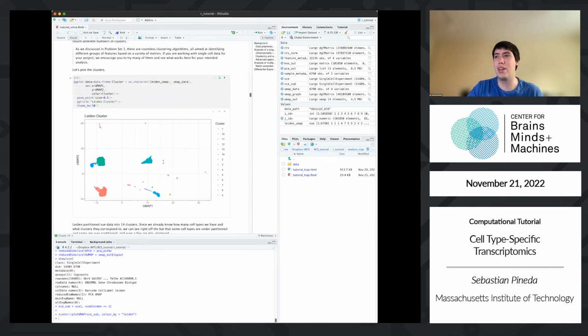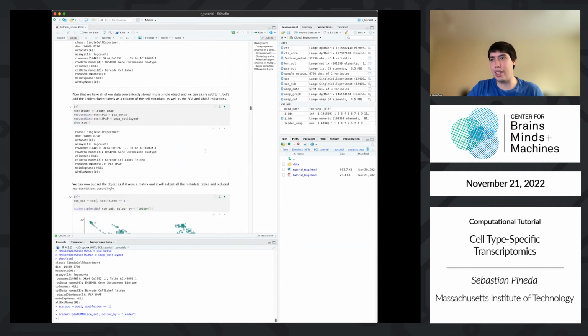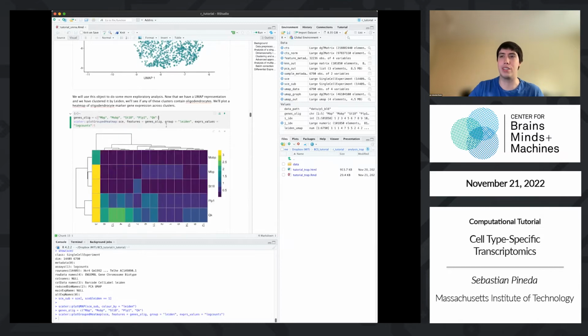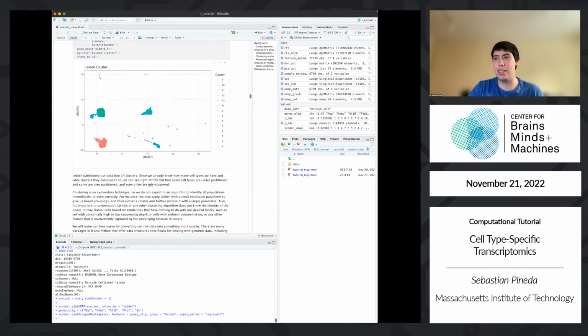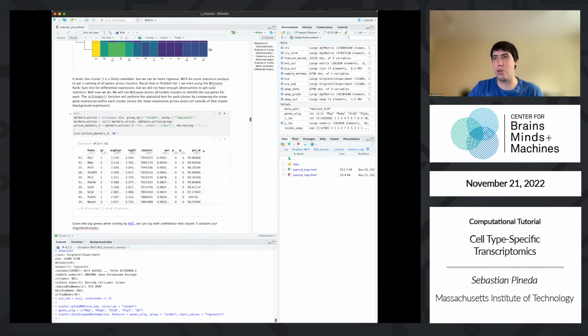And I want to ask, okay, what does my gene enrichment look like within these cells? So these are 5 canonical oligodendrocyte marker genes, and I can ask, in what cluster are they present? And it turns out they're all highly expressed in cluster 3. So I can go back to this plot, and this is my cluster 3, and I can say with confidence, okay, everything here is most likely an oligodendrocyte. So I would annotate my cells accordingly.